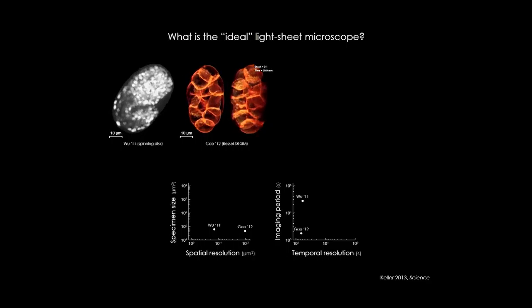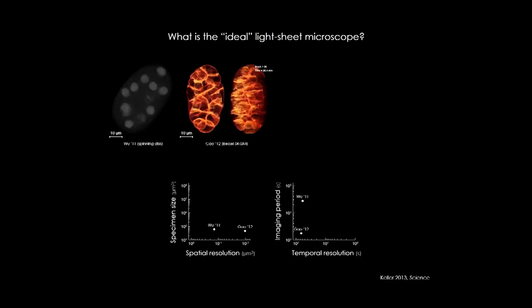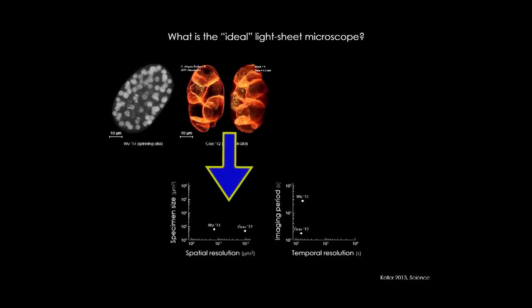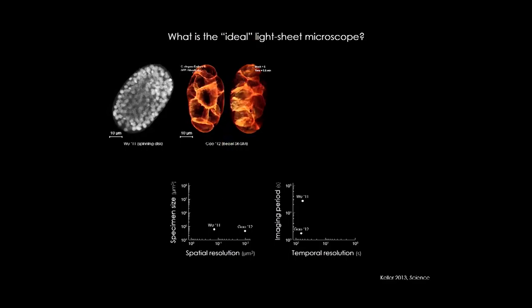And so I'm sure you've heard of the work of my colleague, Eric Betzig at Janelia, who is also using light sheet microscopy to push spatial resolution in these experiments. He is able to get really dramatic improvements in spatial resolution of more than a factor of 10, in the same model system, using really thin light sheets, either using Bessel beams or lattice light sheet techniques.